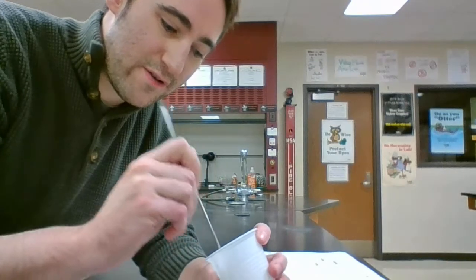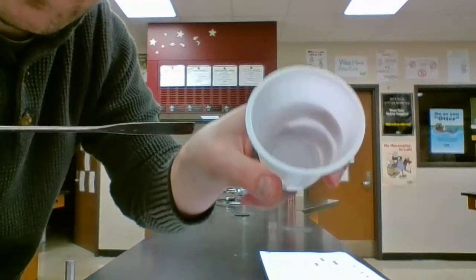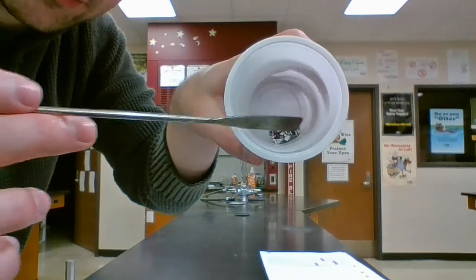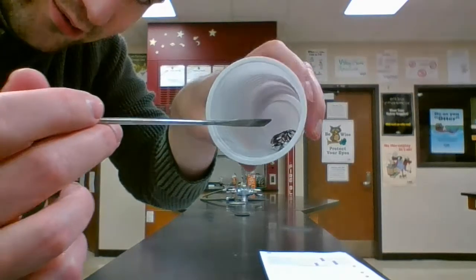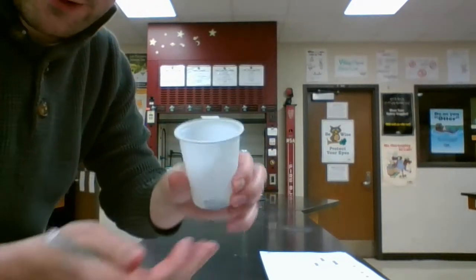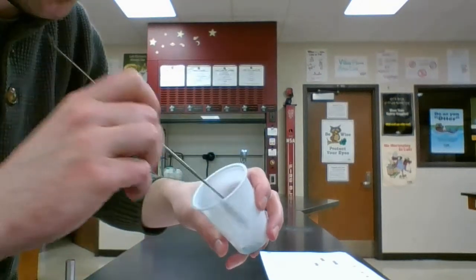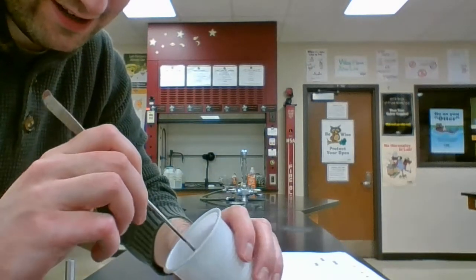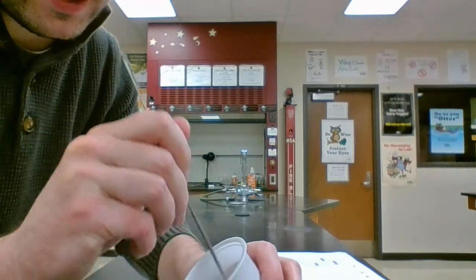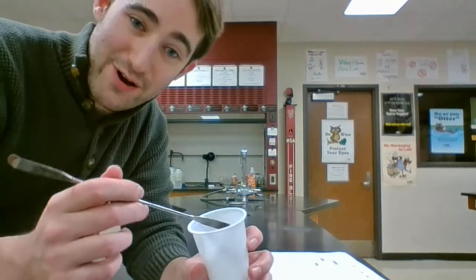If I get this a little bit closer, you might see that the color has changed. I've gone from having this silvery aluminum color to some spots of reddish brown in here, which is kind of interesting. Also, you're going to have to take my word for this, but the bottom has gotten a little bit warmer. It's gotten a little bit hot. If you heard that sizzling noise, that was from heating up that liquid and getting that reaction to go. So we got a couple signs of a chemical reaction going on here.